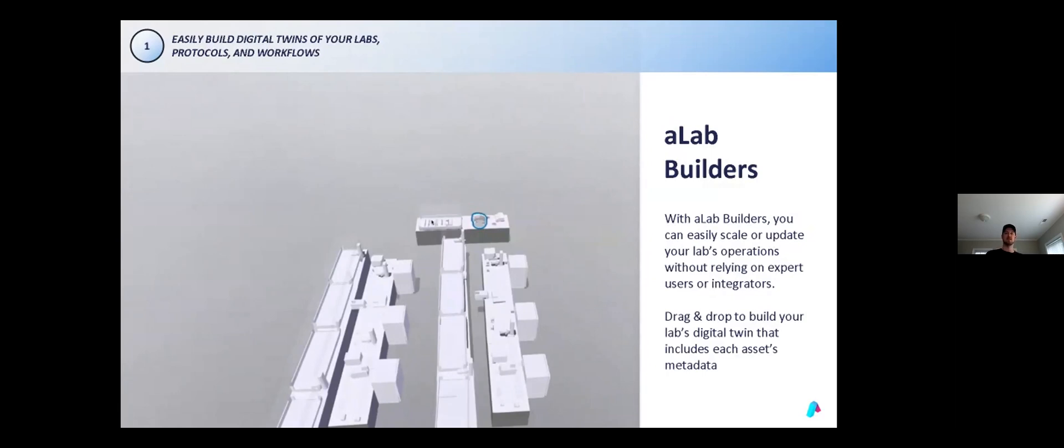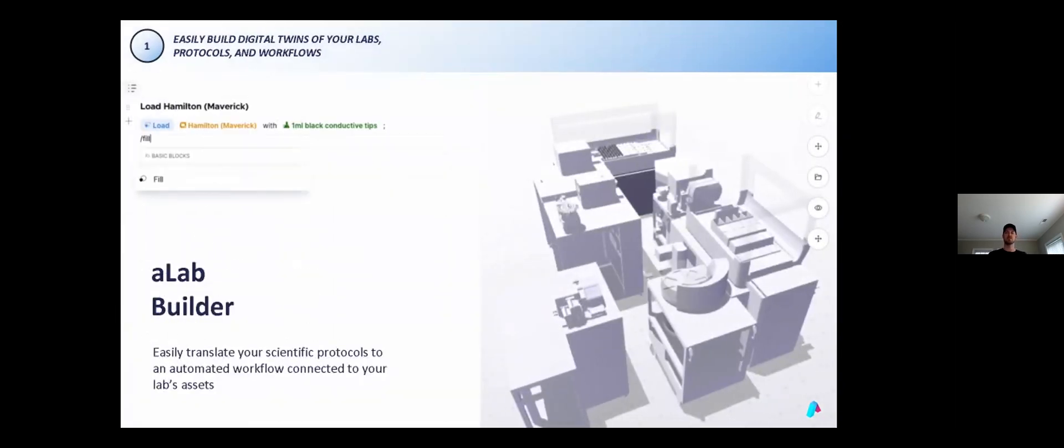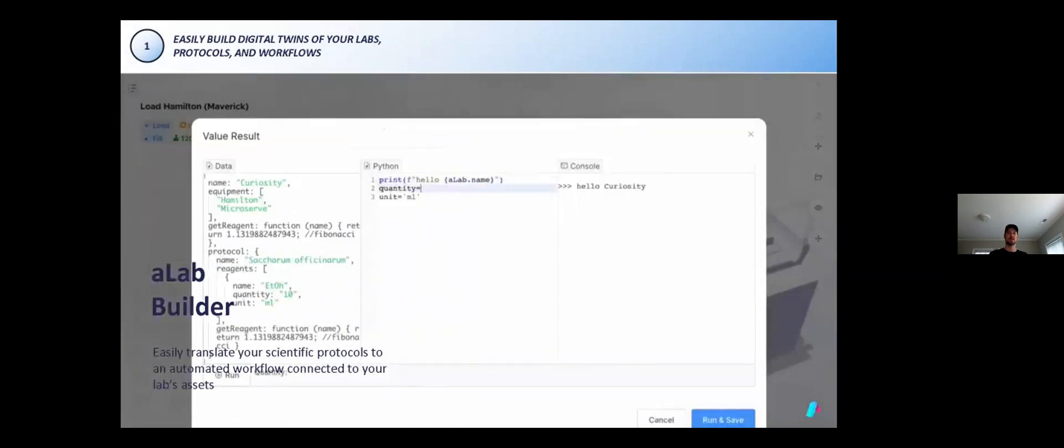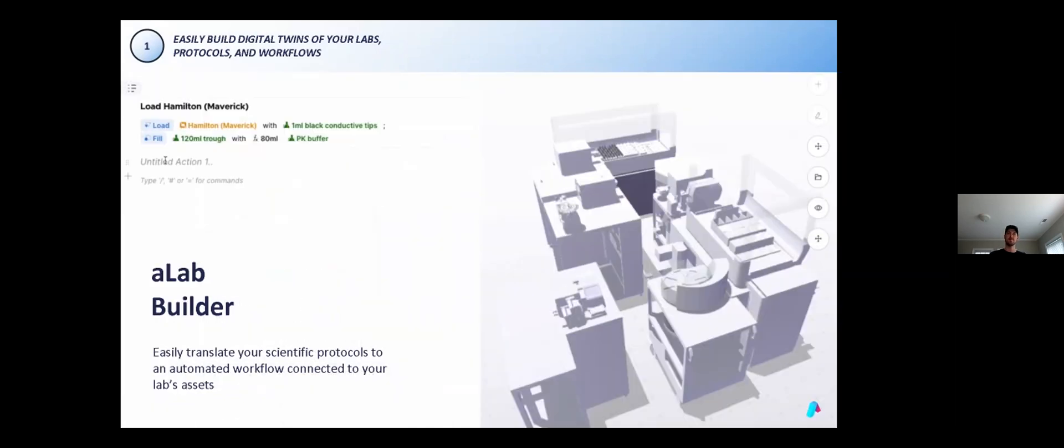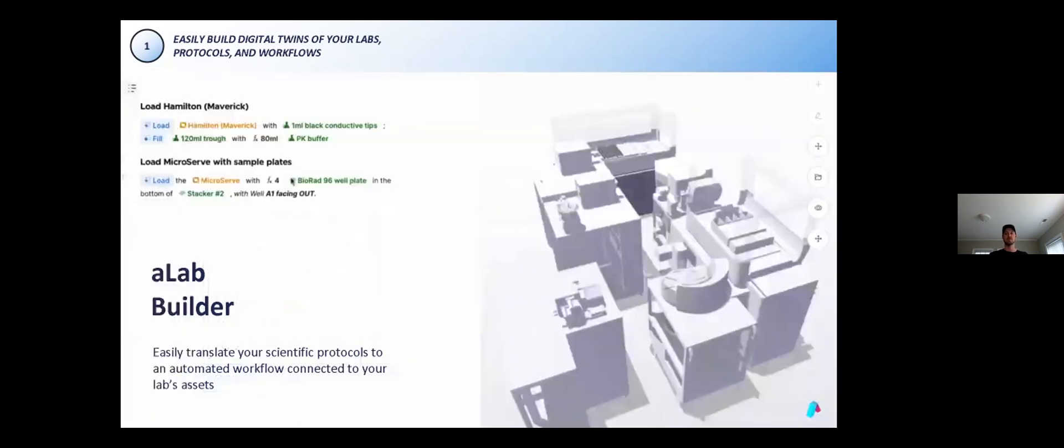Another view in the app is the assistant builder. In the assistant builder, this is where a user describes the manual work that is required for a process to be correctly set up or cleaned up. The description of work is made in a natural language using our markdown language and the digital twin from the lab builder to associate steps with particular pieces of equipment or labware. In the example shown here, we're describing the operations to load a Hamilton Vantage with black conductive tips.